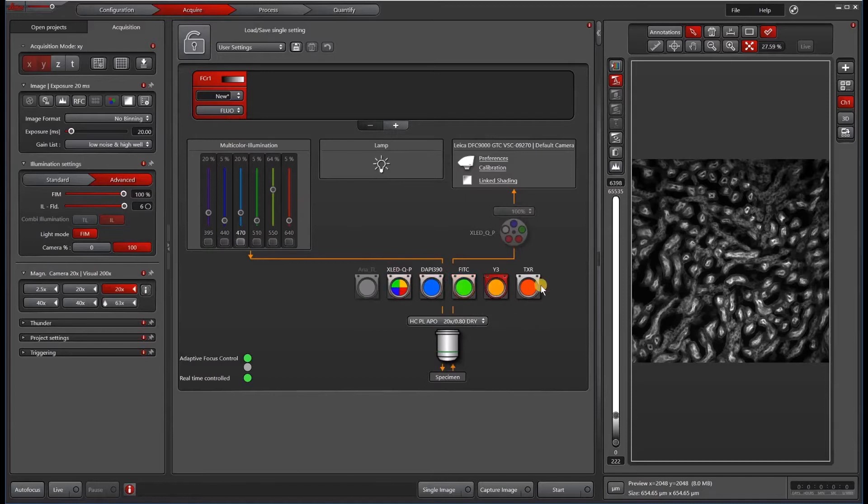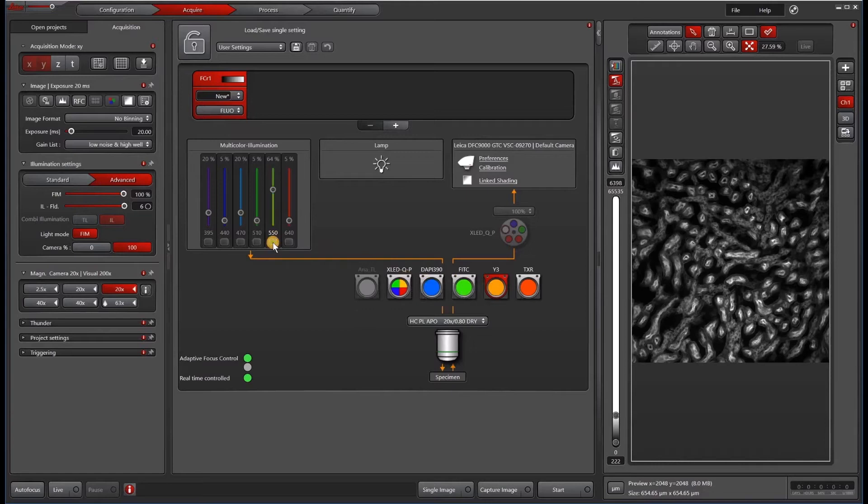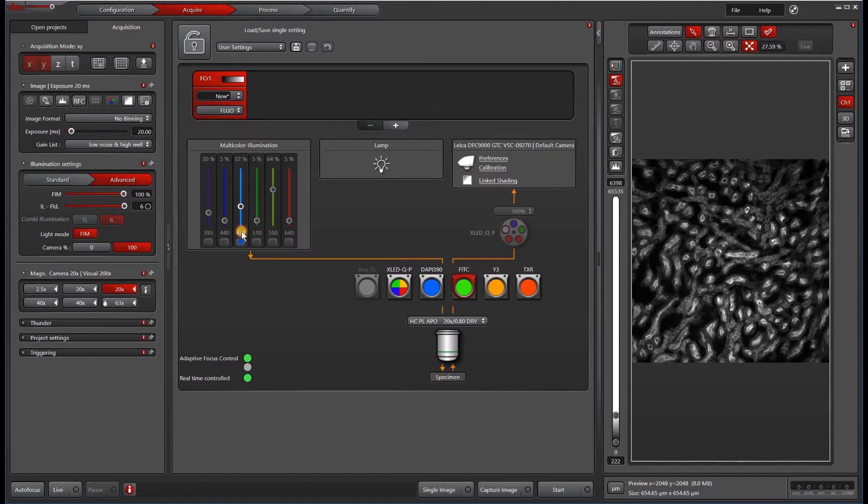You can see that as I click through these single cubes, single lines light up that allow me to turn that line on or off. You can see that I can also adjust the percentage intensity of each line.